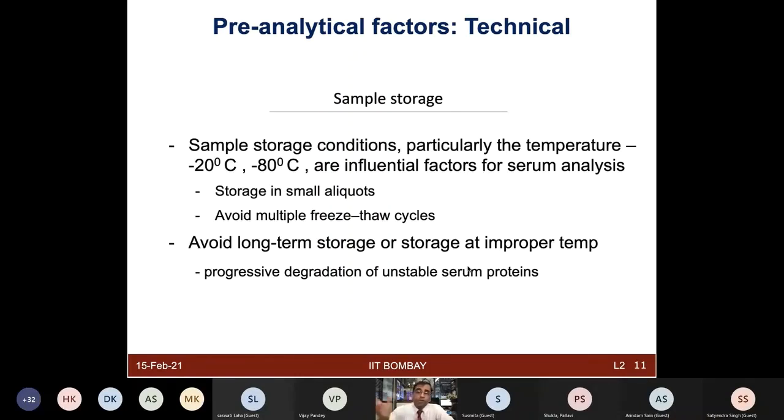Whatever you do, your box is not open, but your colleague is going to open the freezer multiple times, and the freeze thaw will happen at least partially, and you will see progressive degradation of the sample stored for a long time. So it's a good idea, when you are collecting the samples fresh, to process them and get the protein, followed by digesting them to get the peptides. And all of that is then ready for you to store in your -80 freezers.